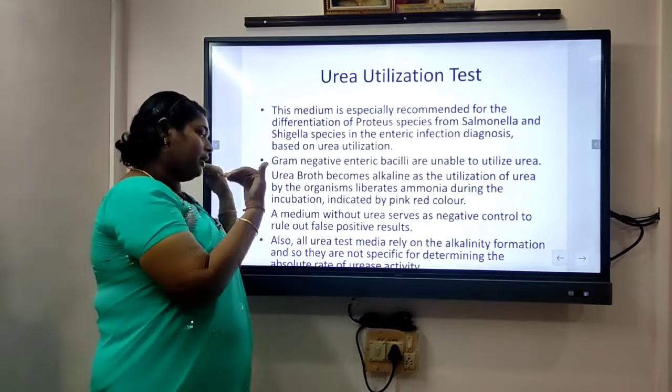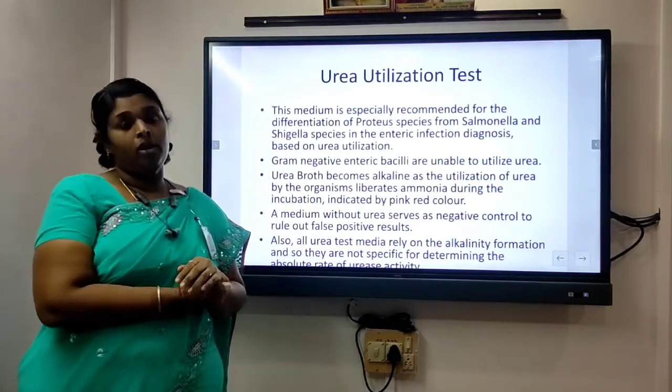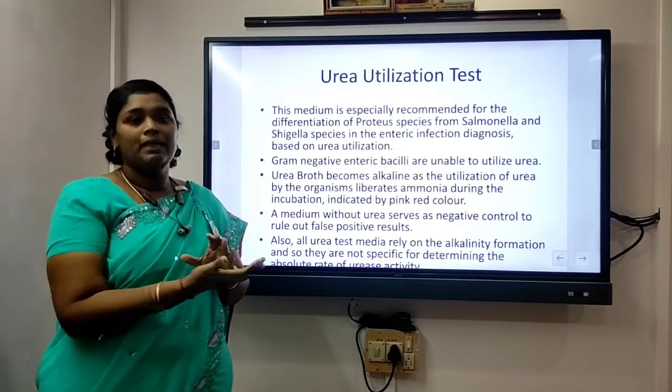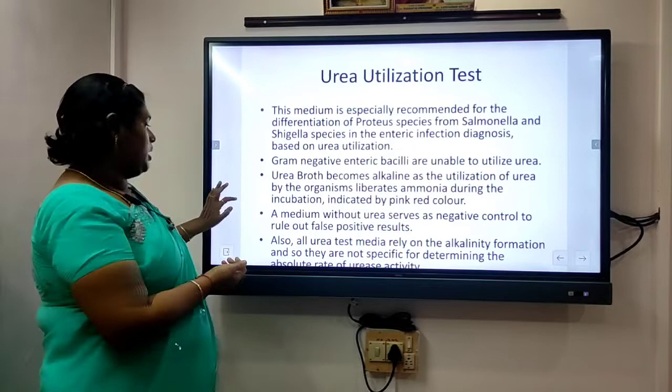So what is the reagent present in this urease medium? It is phenol red. This phenol red will be converting the medium from orange color to pink color. So this pink color is a positive reaction for the urease utilization test. See.